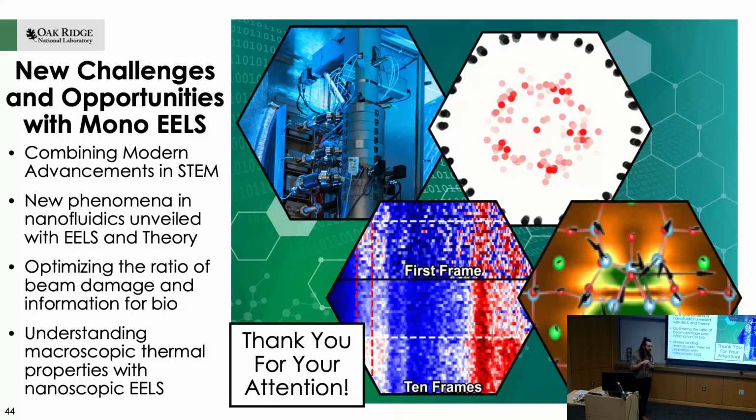So one of the ideas I've been kicking around in my head is maybe we only see this peak when it's a completely filled tube. And when it's a partially filled tube, we're actually chasing the water back and forth across the tube. And by the time I get a vibrational measurement, all the water's gone, so it looks empty. But then in a full tube where there's nowhere for the water to go, we're able to measure it consistently everywhere as we go across the sample. But I have no way to prove that that's the case. That's just an idea I've been kicking around in my head. Thank you.